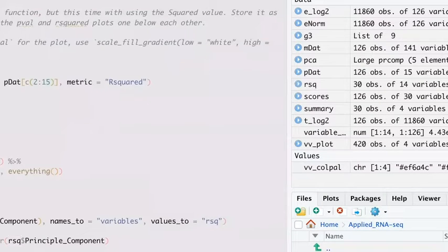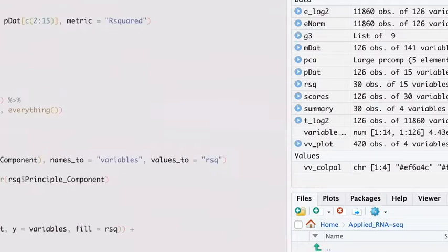So the way I'm running a single line of code is, wherever I want to run the code for that line, I keep the cursor there. Command or Control Shift Enter will run just that one line of code. Or again, if you want to run just this part of your command, then just highlight it and then Command Shift Enter again. So that's the shortcut.